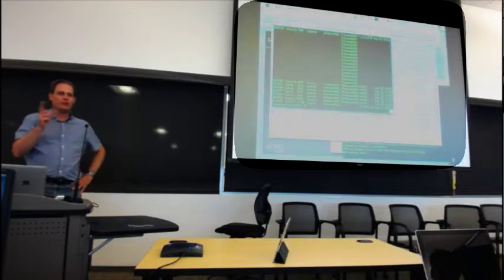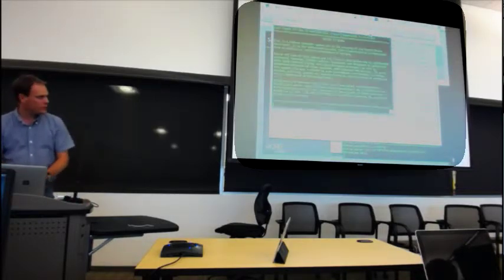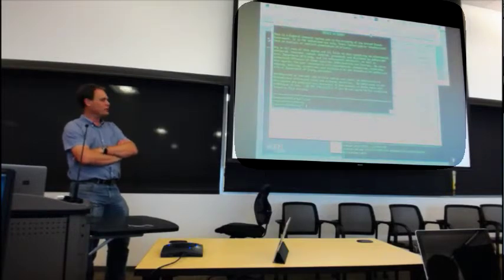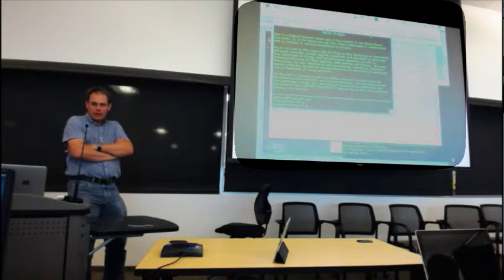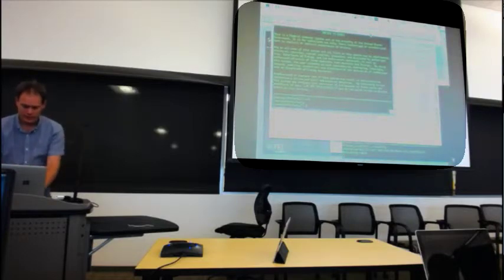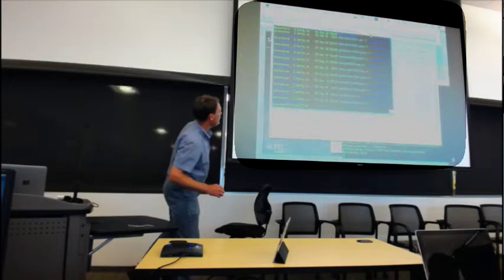So the point of confusion that's going on here is if I go in PS Anna here and I print this, you start off in your home directory, okay? You start off in a home directory like this, and this is a nice little bit of small space that you can see from any nodes and things. It's not where you should put analysis results. Where you should really be putting the analysis is in, what's the experiment number? It's 84914.